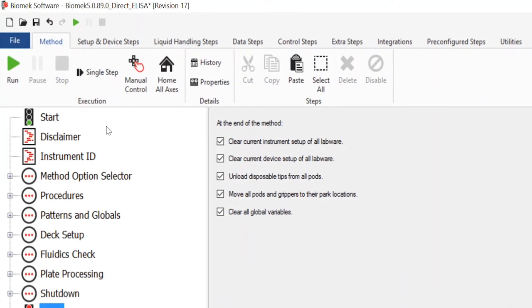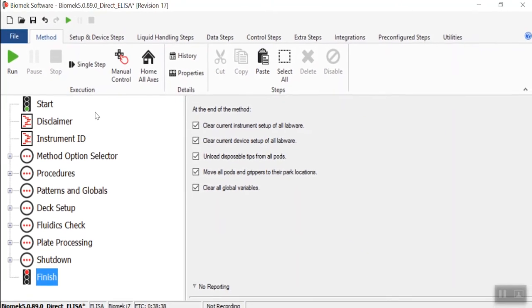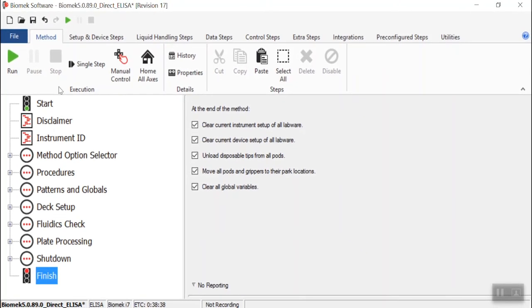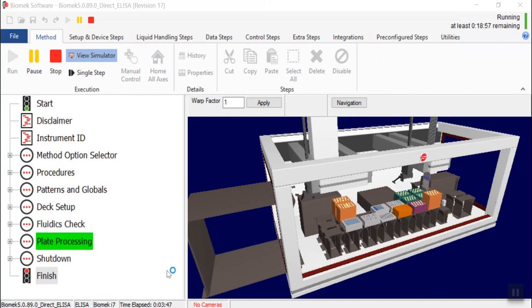The heart of the Biomek is its software. The user-friendly point-and-click interface of Biomek software lets you quickly create powerful methods. The method execution is simulated by the Biomek's 3D simulator so that you can take a peek at your ELISA method before running it.